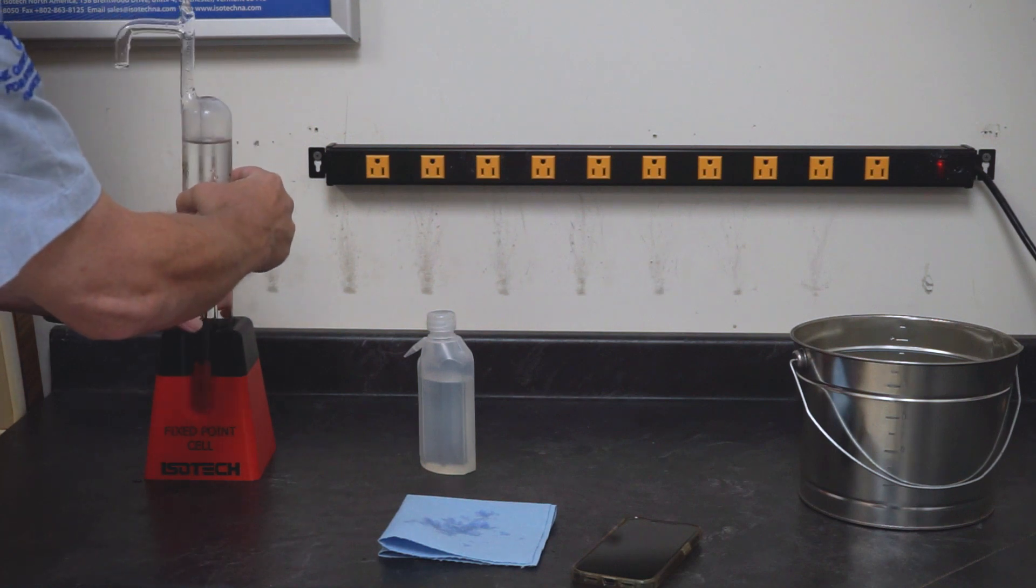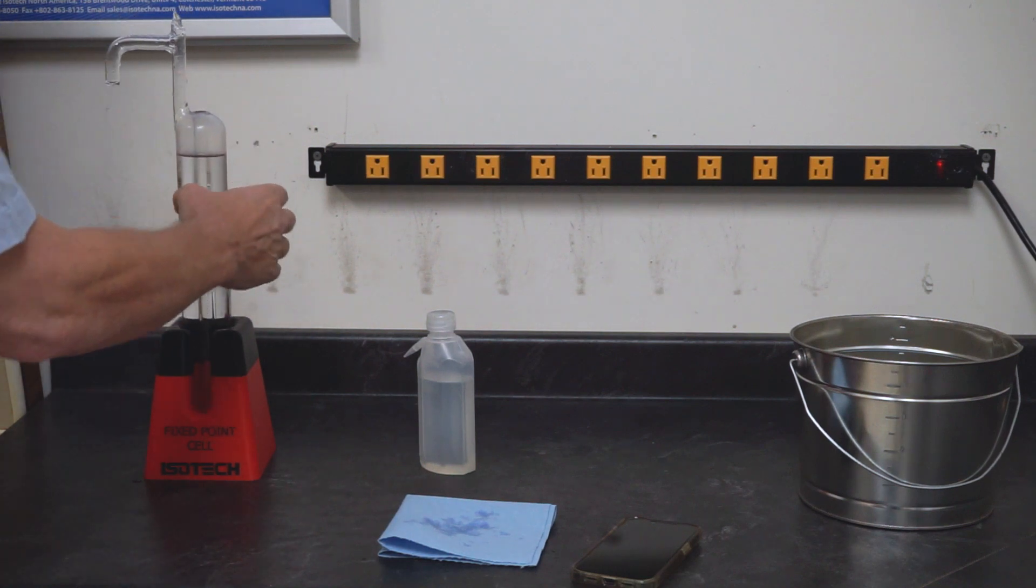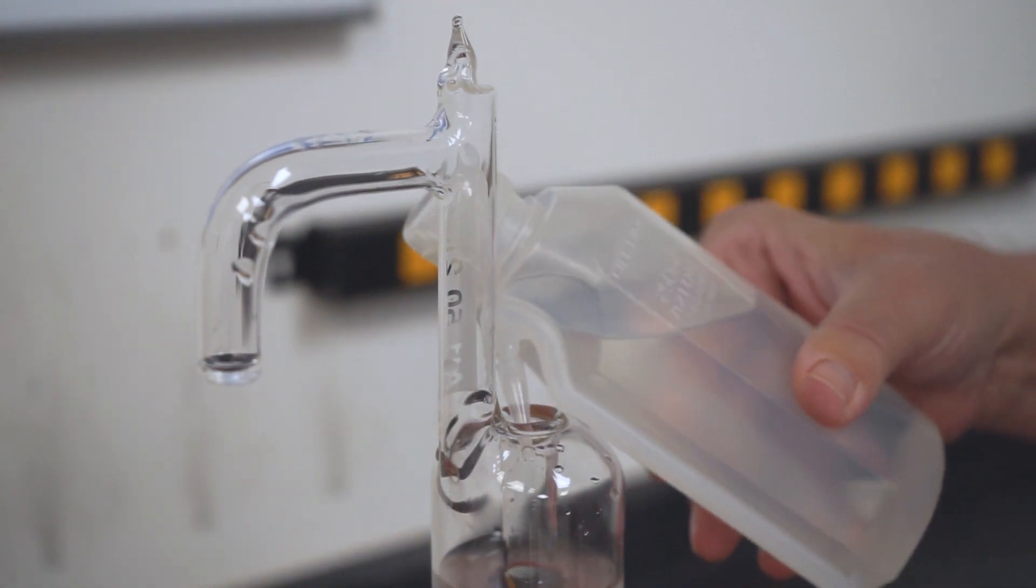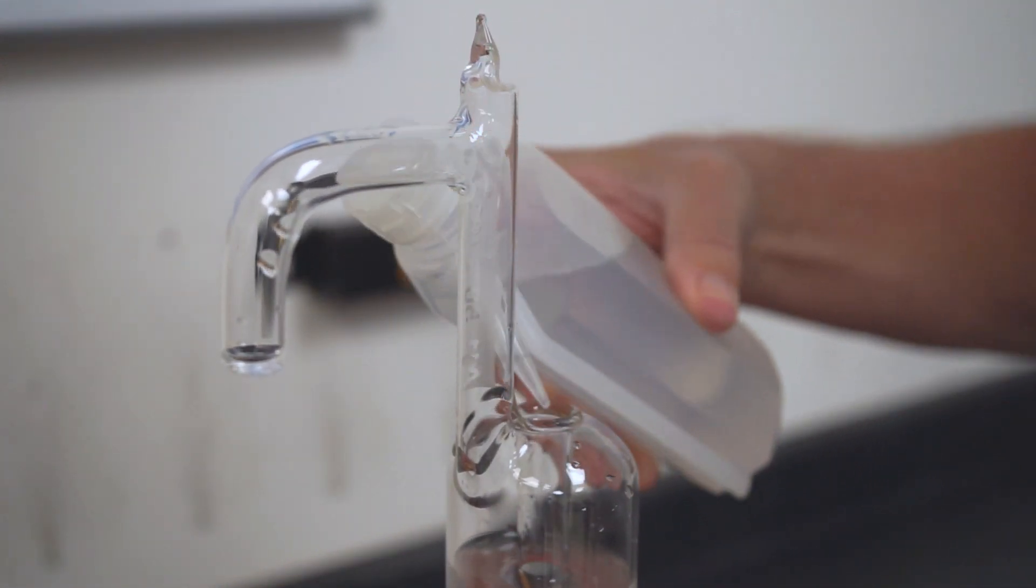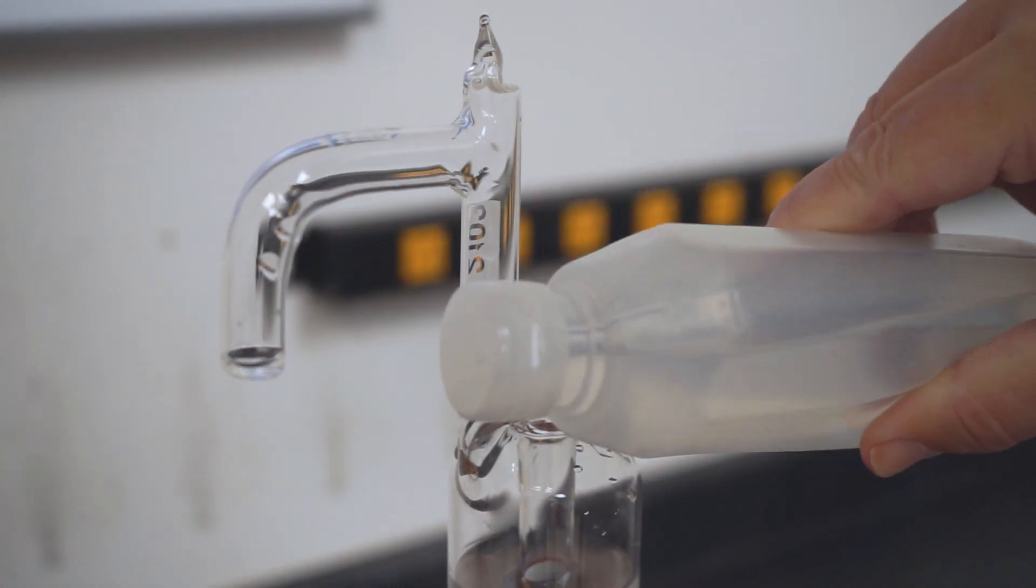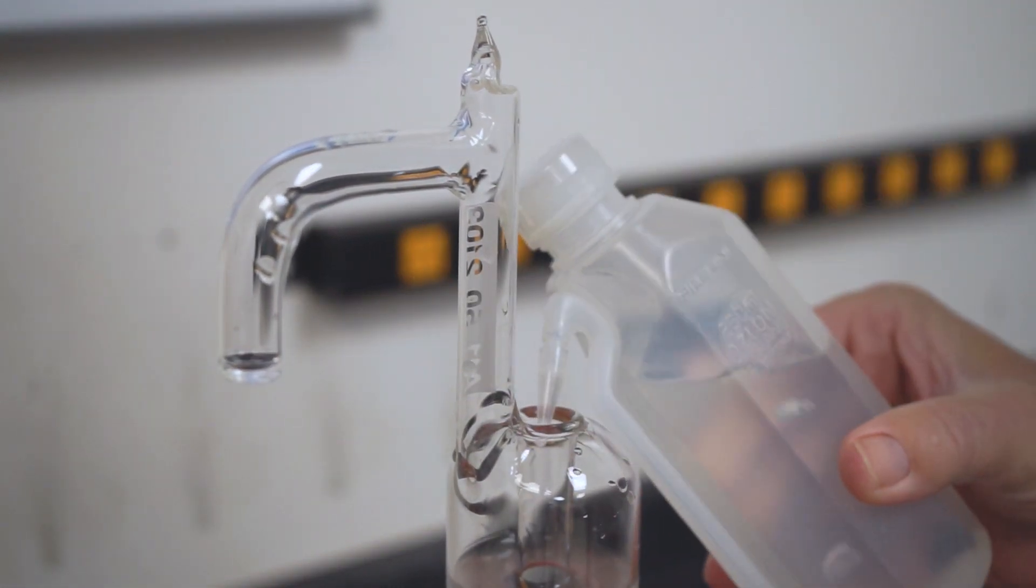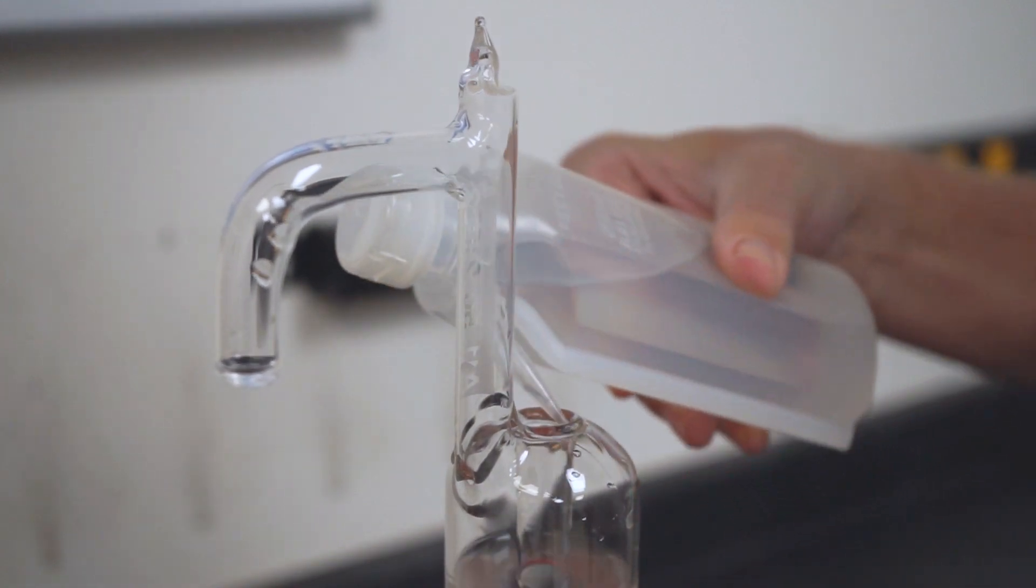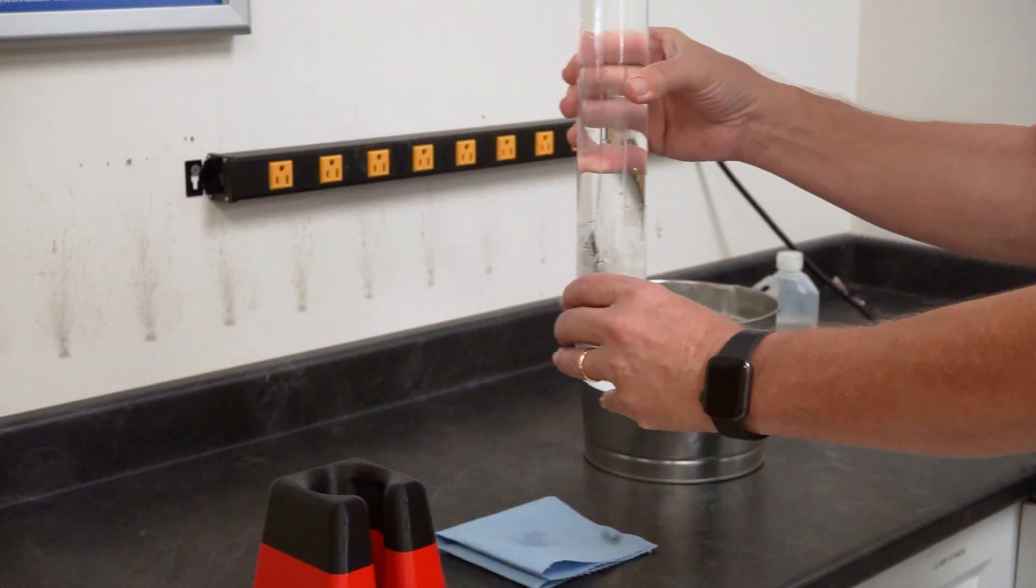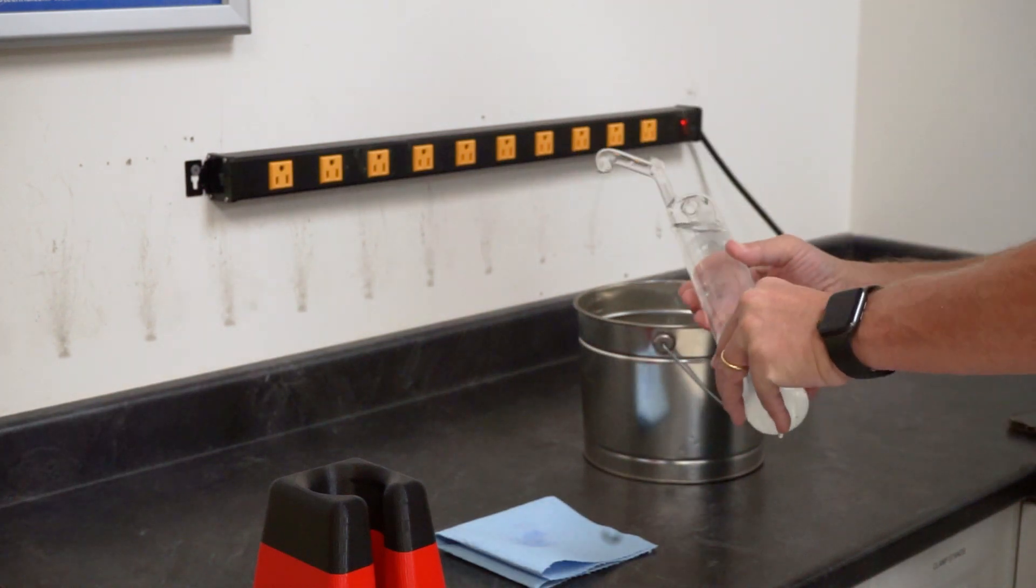After removing the cell from the maintenance bath, carefully place the cell in the cell stand. Then do two laps around the top rim with an acetone dispenser. Acetone is hygroscopic which means that it absorbs and dries water to minimize ice growth in the re-entrant tube of the cell. Once the acetone reaches the top of the cell's water line, remove the cell from the stand and dispose of the acetone into your waste receptacle.